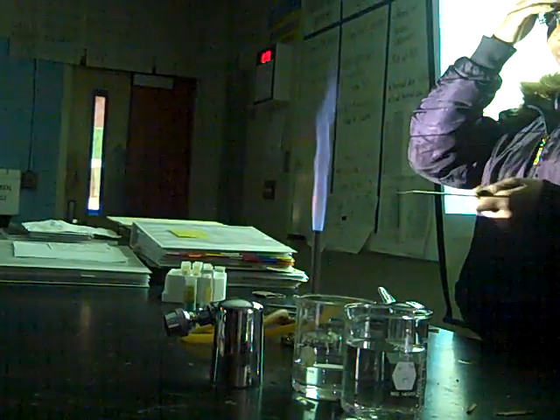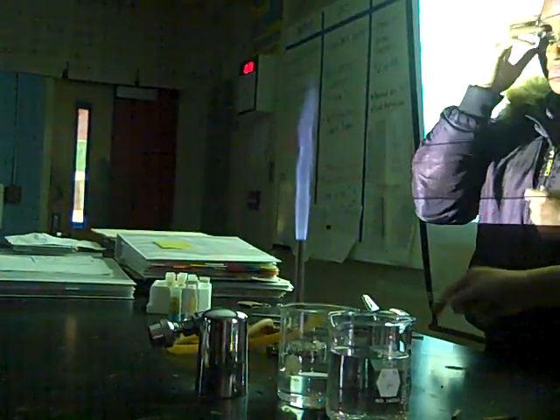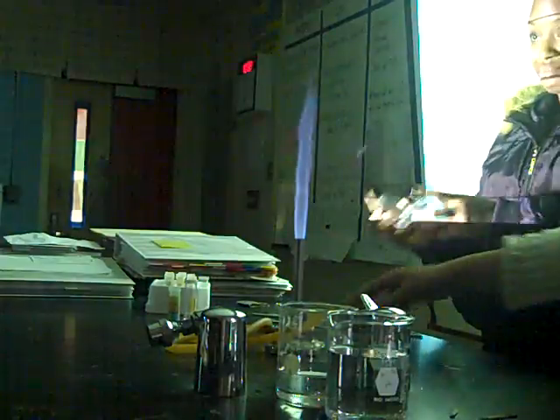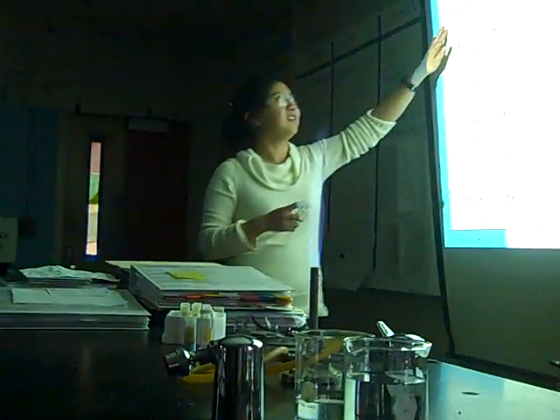It's like a barney out there. All right, there. Yeah, it's a pinky, kind of pinky, orangey, purpley. Yeah. All right, awesome. Thank you, Bianca. Is that potassium chloride? Yes, sir. Yep, that one was potassium chloride. So we're right here right now. That was potassium chloride.